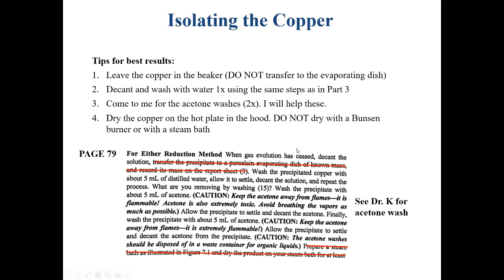Okay, so I'm not going to cover this last slide. This is just some steps for isolating the copper, but I left it in here so you can see what we do. I left it in because I want to talk about the difference between what we do and what they do in the video.